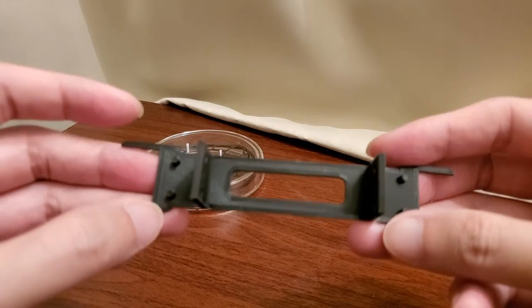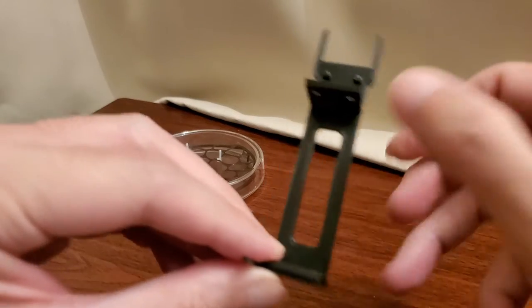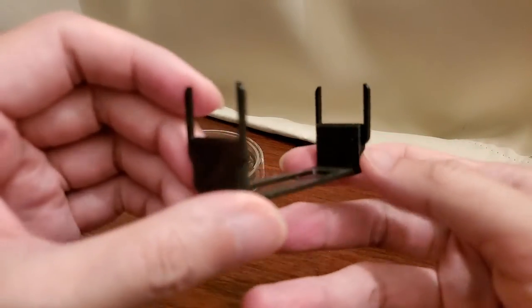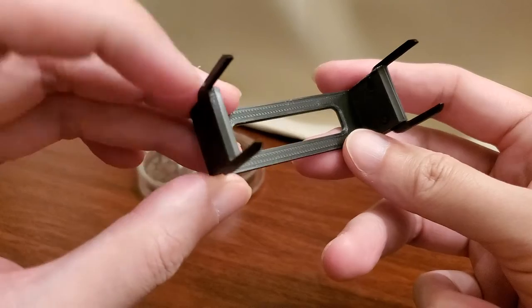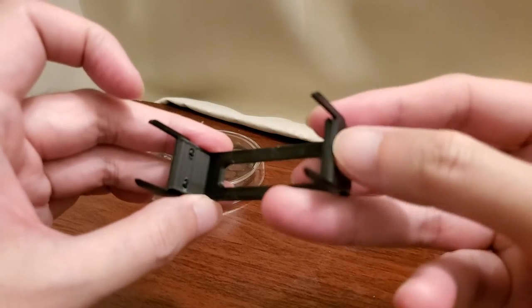Now let's assemble it. Ta-da! Not bad. Look at that — made together, right there.